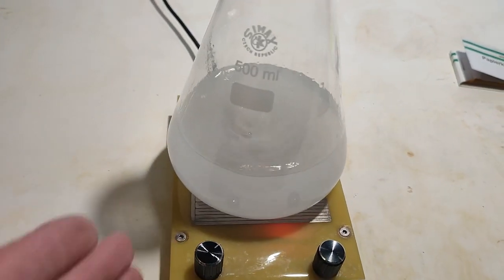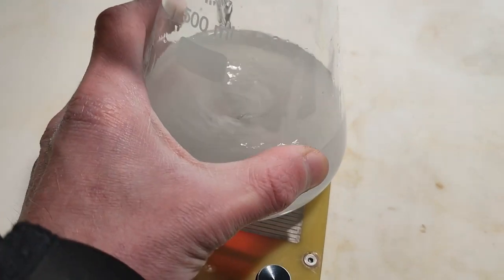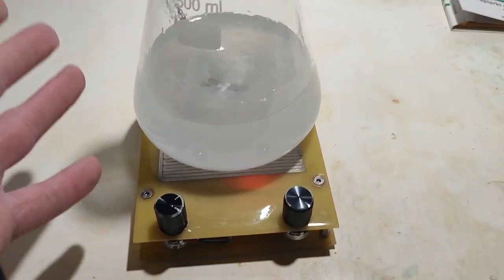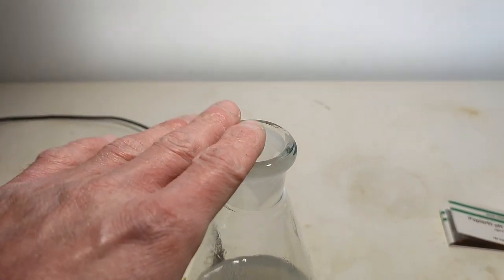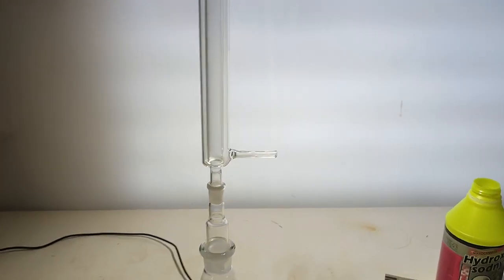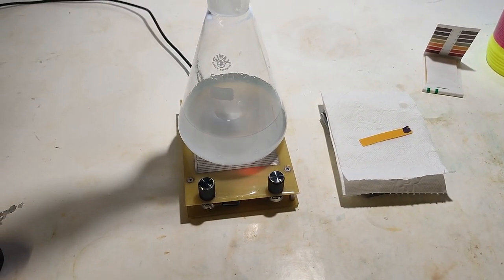Now the thing is that you have to stir it quite violently, and this is already quite warm from the hydroxide. It is very cold here, like that cold. Since this is relatively hot and I am stirring violently, I will attach some condenser up here. Not that it will work, but I will do it anyway. Okay, so the condenser is attached. I'm not cooling this thing because it doesn't make any sense, I would say. And yeah, I'll leave it run for about an hour.